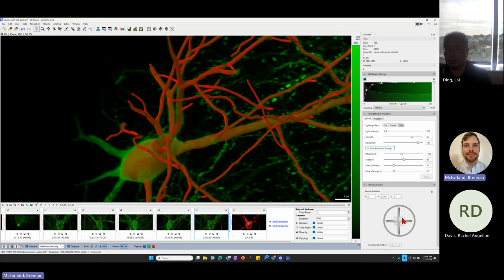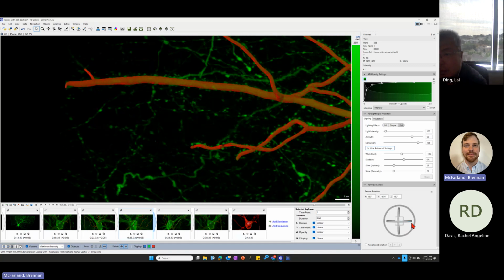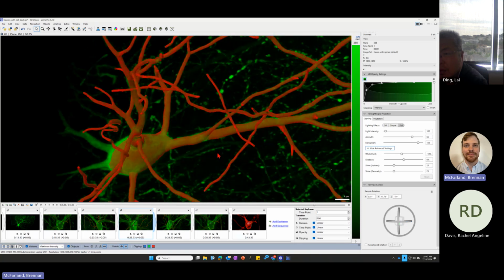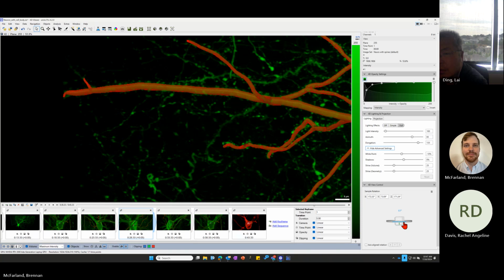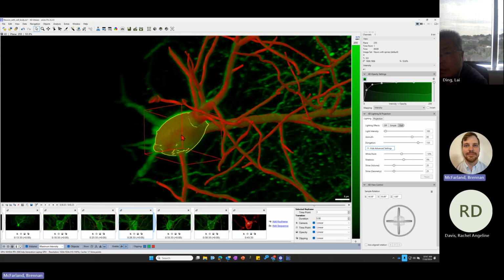Another thing that we can do is, and maybe this is actually where if we wanted to do that rotation around a center object, maybe this would be the better option. Because we can just click one of these axes and then move around it. So you see, you can click this object here. It is a way that we can set this as our center point and our focal point.